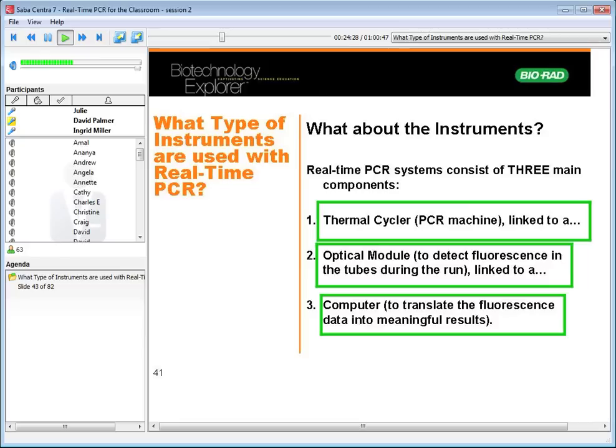What ultimately happens with this is for different DNA sequences, you'll get a totally different melt curve, totally different shape curve for different sequences. And this can be so specific that it can tell the difference between an A and a T base pair at any given location. So it's commonly used for mutation analysis or mutation screening.